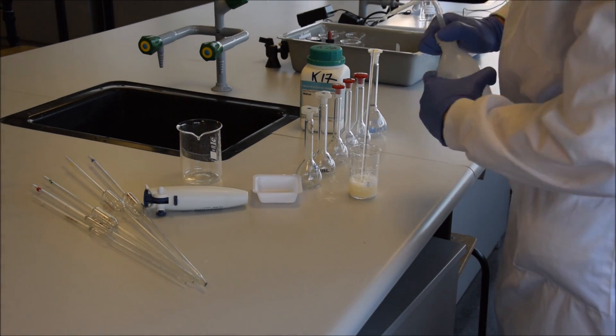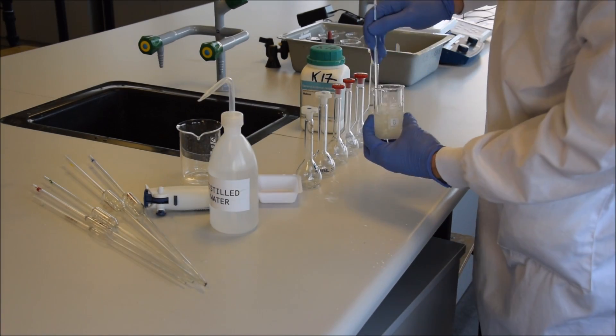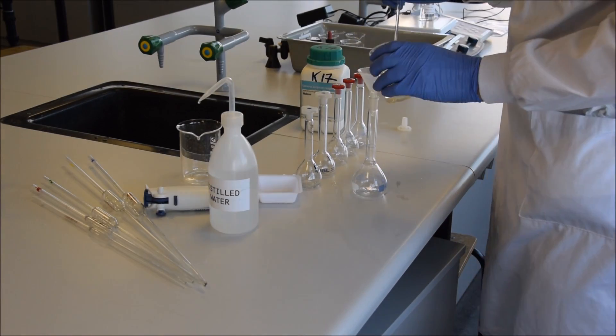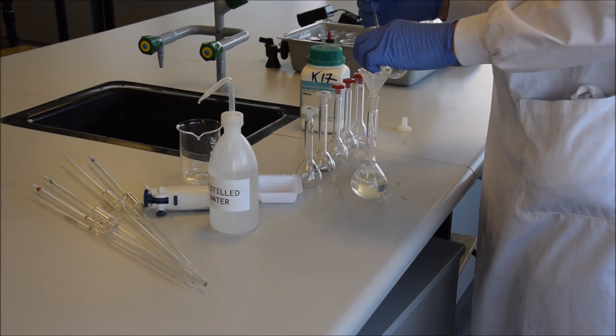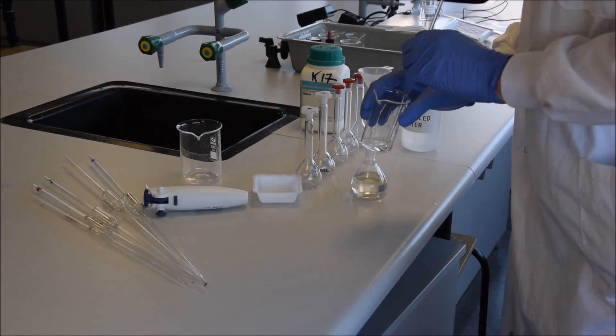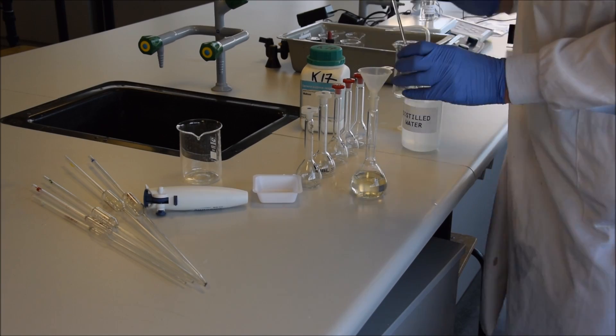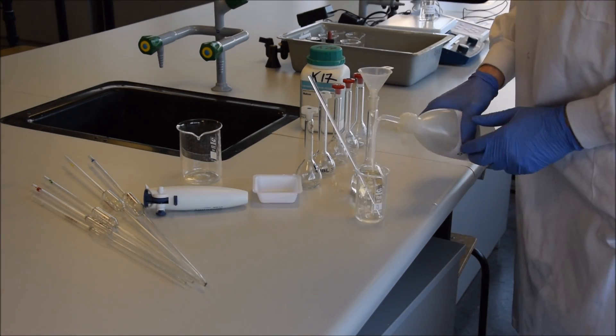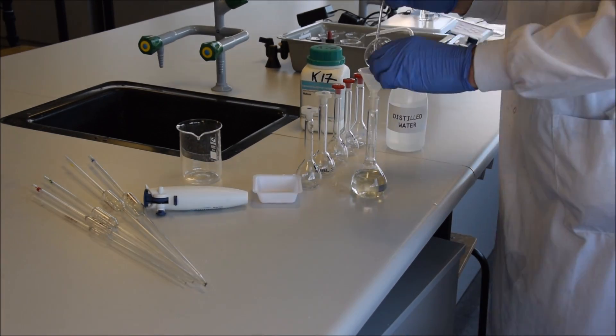The first thing we've got to do is make up some standard solutions. I've weighed out exactly 10 grams of sugar and I'm going to quantitatively transfer it into a volumetric flask, making sure all the material gets into the volumetric flask, none of it spilled, wash everything down, properly dissolve it, and then the very last thing I do is make it up to the line.